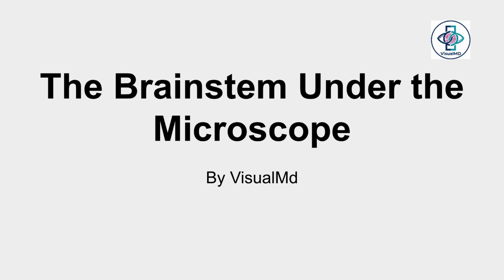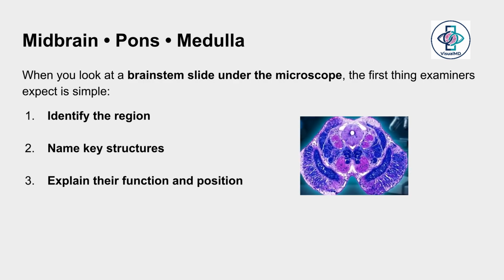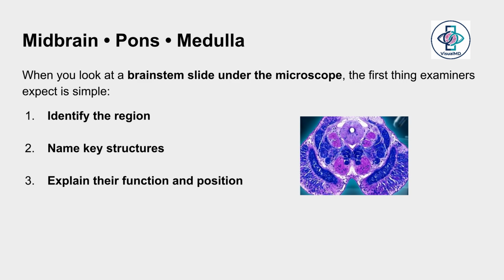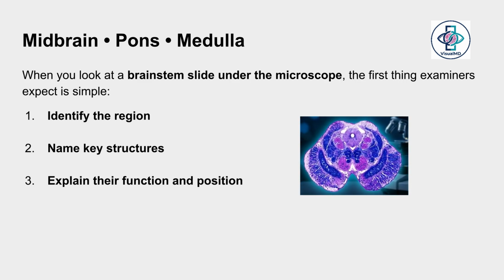Welcome to this video on the histology of the brainstem, brought to you by Visual MD. When examining a brainstem slide under a microscope, you'll need to identify the region, name key structures, and explain their function and position. We will cover the midbrain, pons, and medulla.